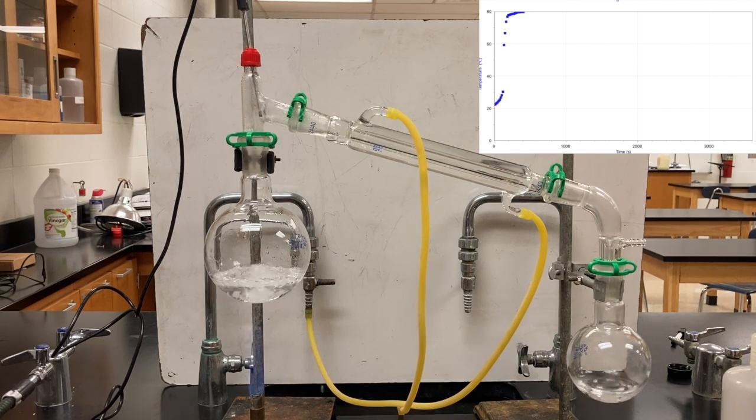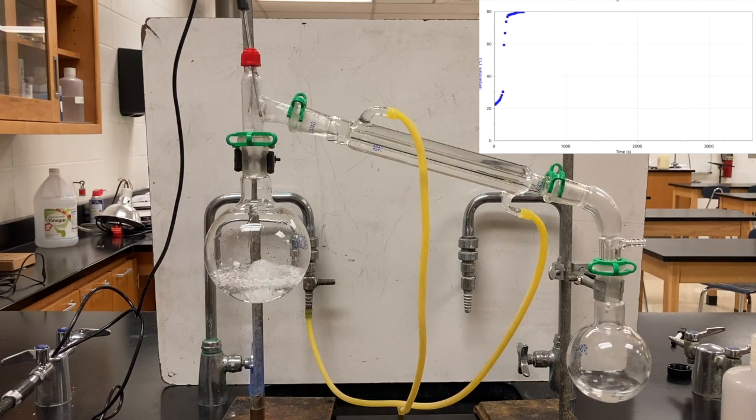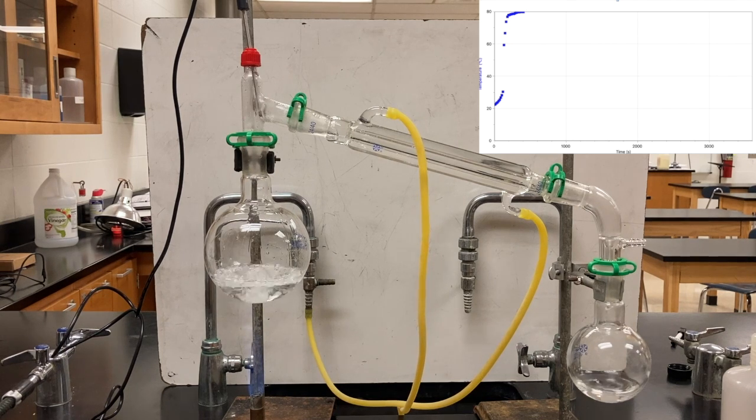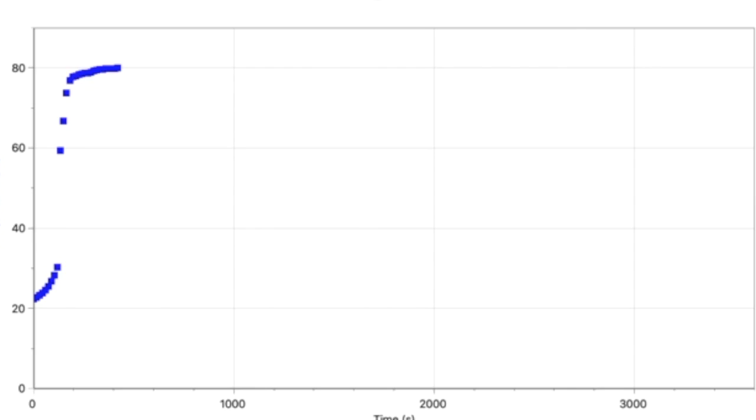You can see now that there's a flat spot developing on the graph. That indicates that we're primarily undergoing a phase change with the energy that's being added, although it's not quite as sharp now as it would be if this was a pure substance that was vaporizing. We can see that the flat spot is at around 80 degrees, so that's not water. So that must be the boiling point or approximately the boiling point of the ethanol that is in this mixture.